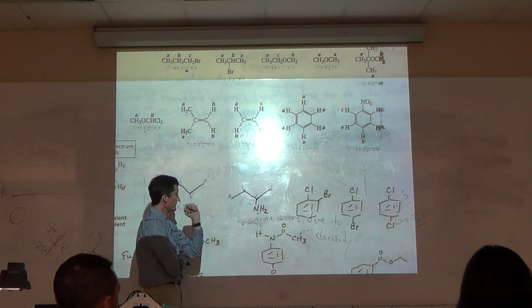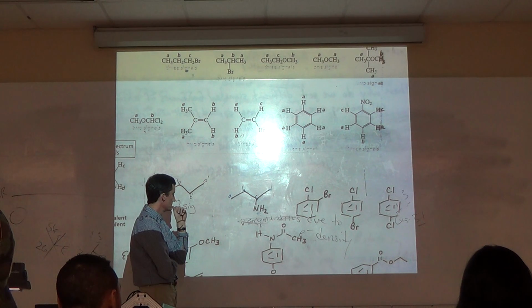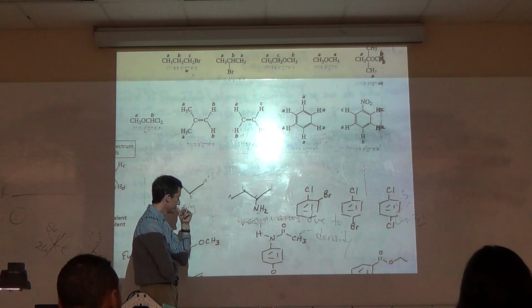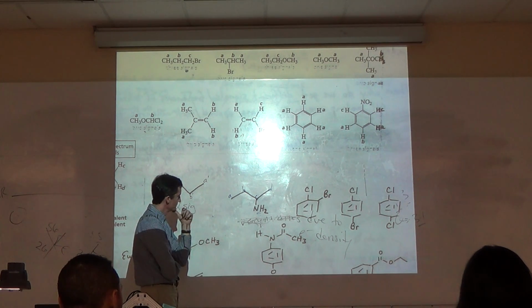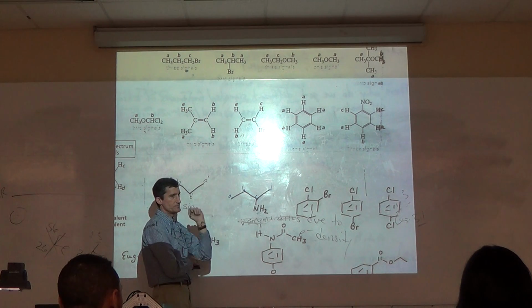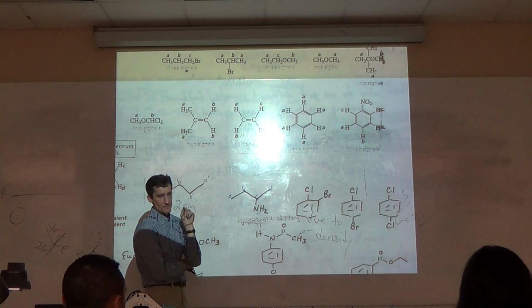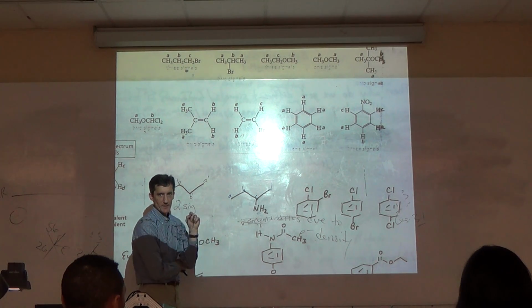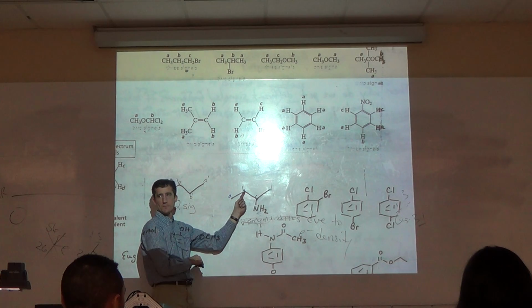That is tetrahedral. Well, not these two. I'm lying a little bit about 5, because I don't want to get into this. I'm not sure these two on B are the same.